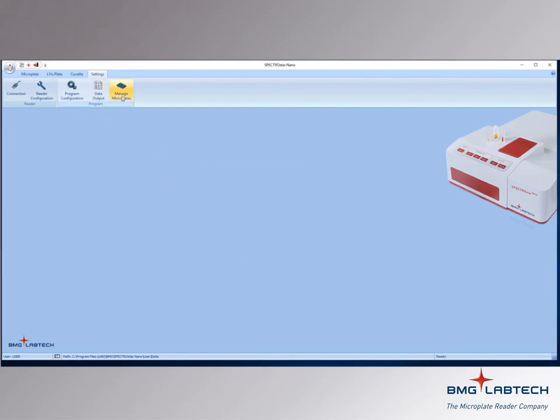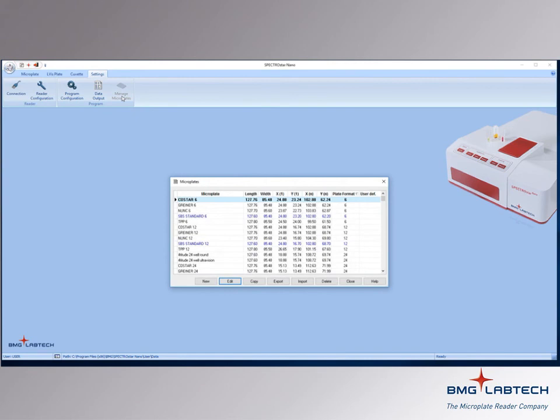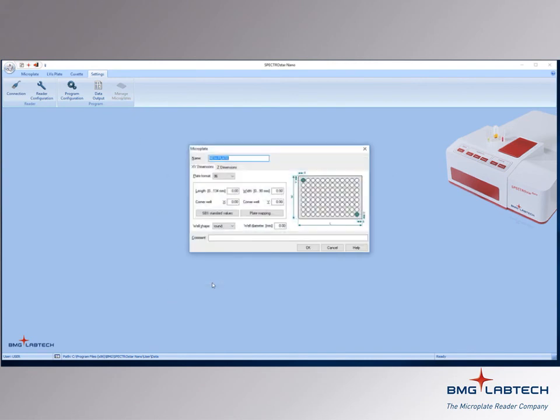And, if you need, you can add settings for new microplates or adjust those that are already defined.